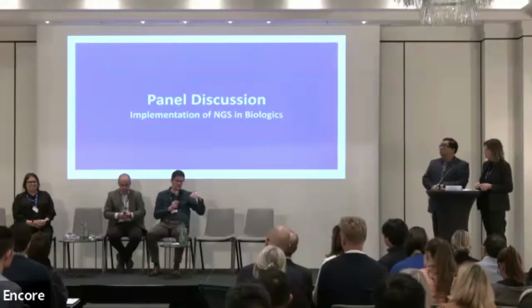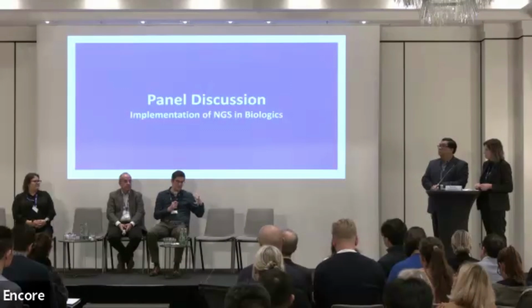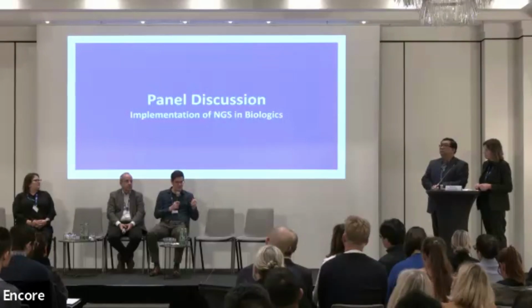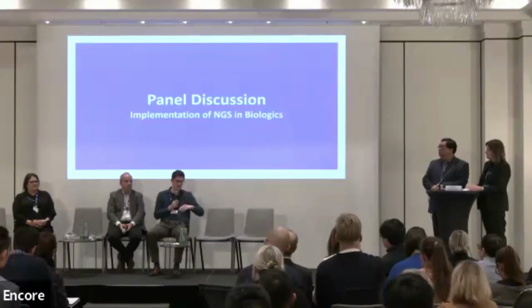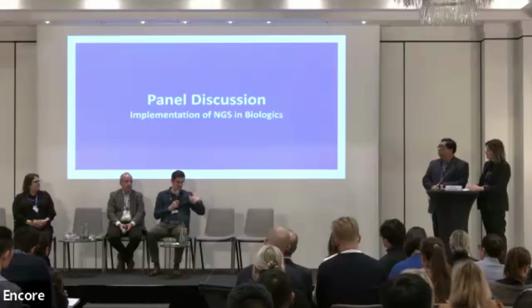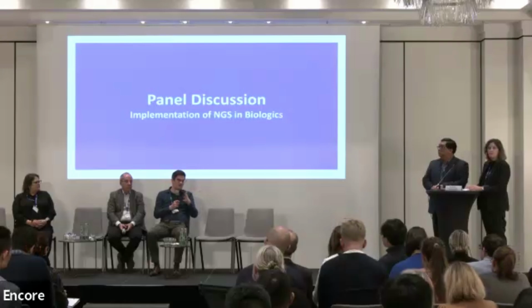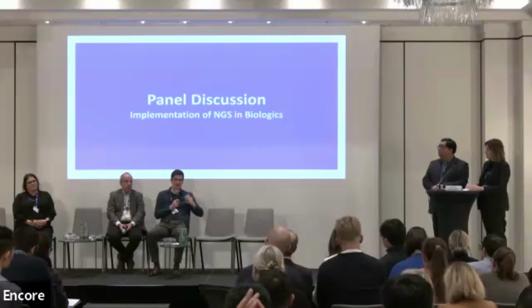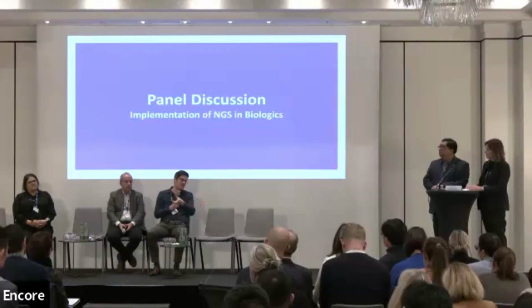So then the qualification is indeed a read mapping approach, which is separate, because we do k-mer development as well. But there is no pre-knowledge required, because we take all the reads that hit the viral database, irrespective of whether it was a species result or family, and then we qualify against all of RefSeq, RVDB, and GenBank. So you don't need to know what's in there, because you take all your data, irrespective of where it is in the viral kingdom, and then you map it against that same database that you k-merized before.